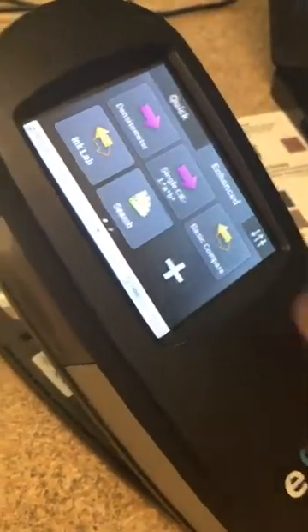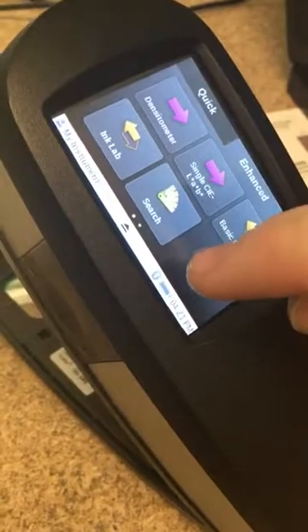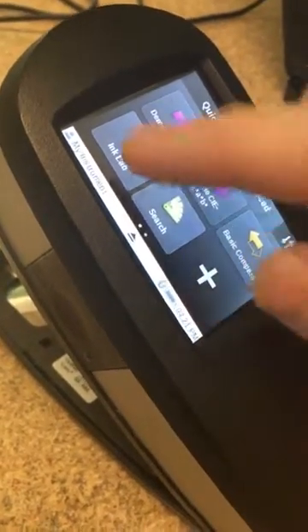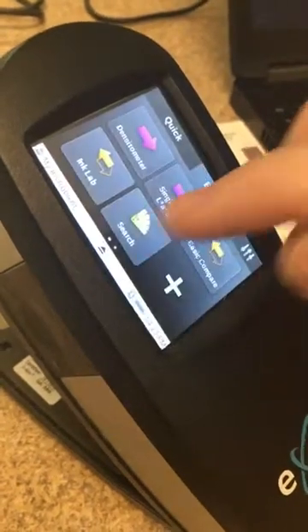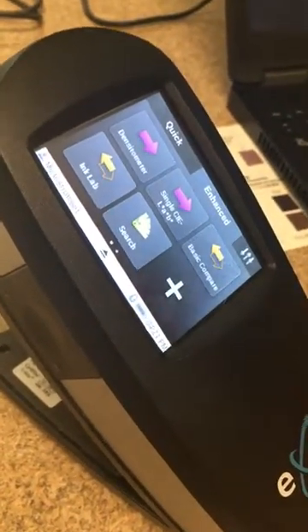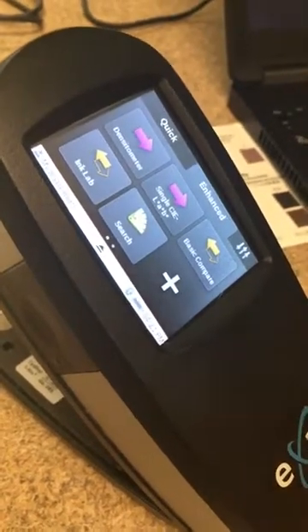At the bottom, you can see the bottom bar — it tells you this is connected via Bluetooth, shows your battery status, and your date and time. If you push that little arrow, it pulls up a box with a bunch of settings. You can change your language, turn Bluetooth on and off, change power settings, and more. That little up and down button structure is very important because it's used differently in some of the other applications.